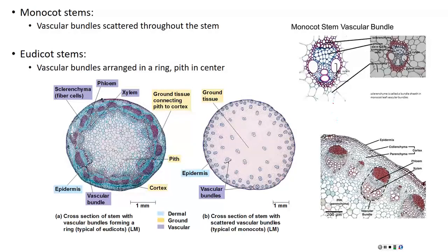Let's look at what's going on here. So phloem, I always think the Monocot vascular bundle looks like a little face, and the forehead is the phloem. Okay, so there's our phloem. And then we have our much larger xylem, and then we have some very thick-walled cells called sclerenchyma around it, helping be protective.